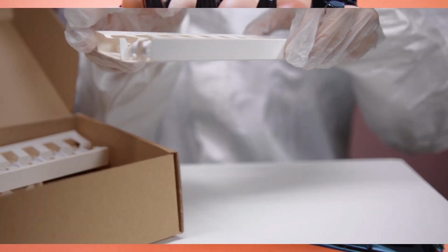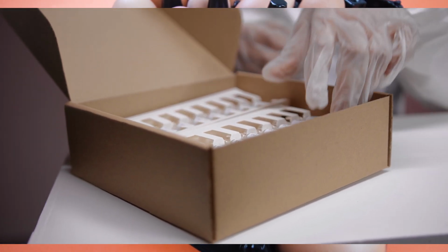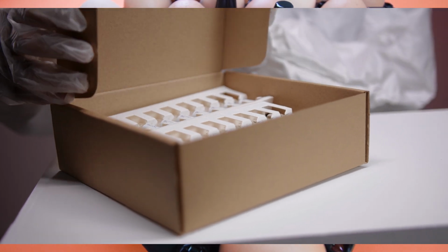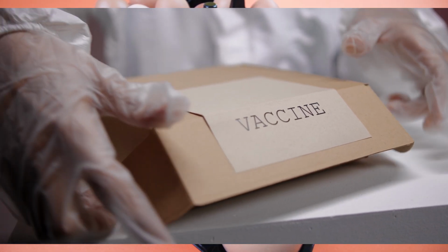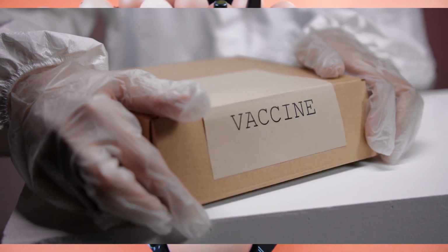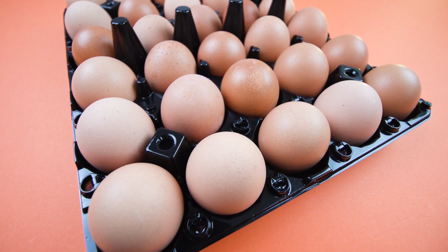It's then washed with Triton detergent, which further helps to break up the material and separate into what is wanted and what is not wanted for another attempt at centrifugation. This further separates that material based on size this time, and by having large particulates, which aren't any use in a vaccine, and the addition of more formalin, you can ensure that any virus left over, and it's only virus at this point, is deactivated and is safe.